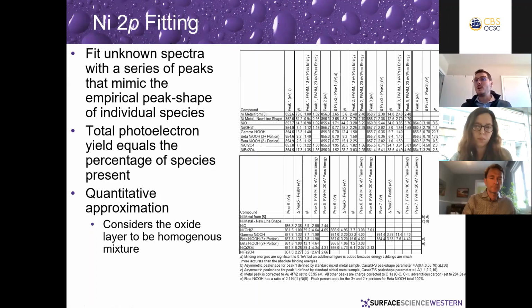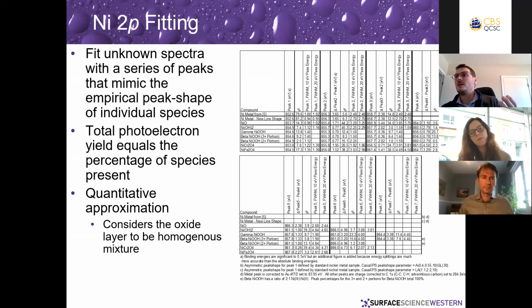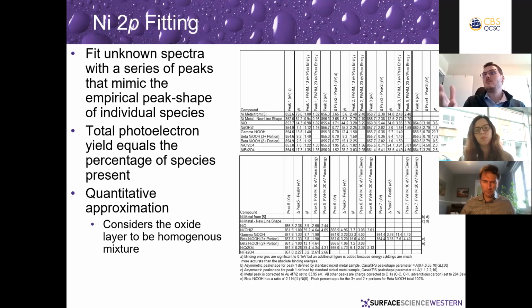in say something like infrared spectroscopy, you can actually do spectral subtractions of whole spectra, right? And that works usually pretty well. But with XPS, there are some issues, like the charge correction is only good to, say, for the adventitious carbon, plus or minus 0.1, 0.2 eV attached to it. If I take a spectrum on my state-of-the-art Kratos Axis Supra, and then someone gives me a spectrum from, say, an older instrument that has a poor resolution, the spectral subtractions won't work anymore because you've got these wings on the end. So we do it this way so that I can apply it to a variety of different resolutions, different instruments, etc. And it's more universal.